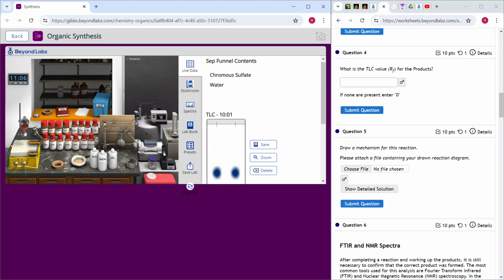Normally, the aqueous layer is the layer that has color, and the organic layer is the layer that has no color in it. We want the organic layer because benzoic acid is in the organic layer. So I'm just going to go ahead and grab the organic layer, just the organic layer, and leave the aqueous. I don't care about it over here. So that is my product. And notice at the final stage, I managed to isolate the benzoic acid, just the product. I don't want any impurities with it.